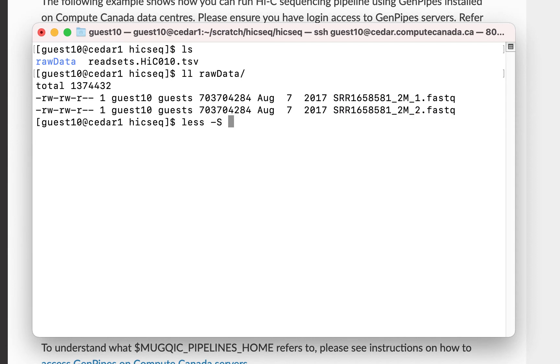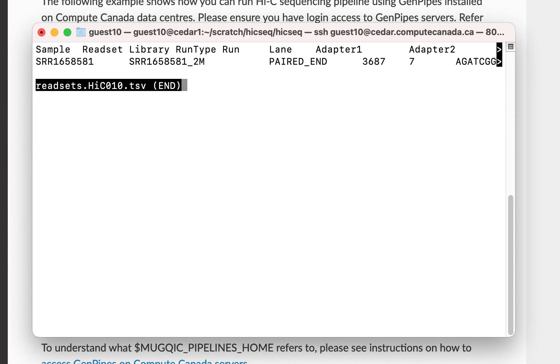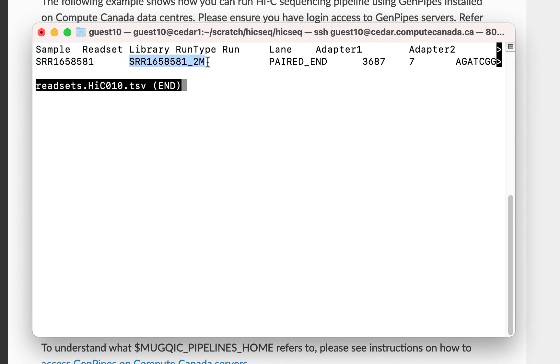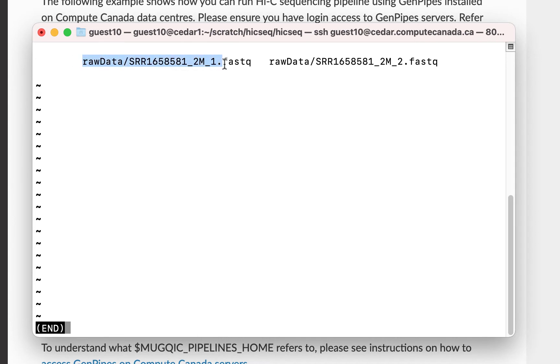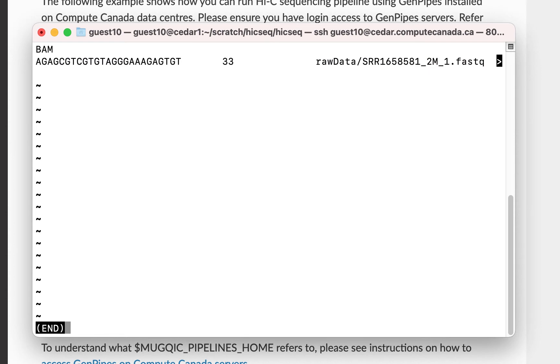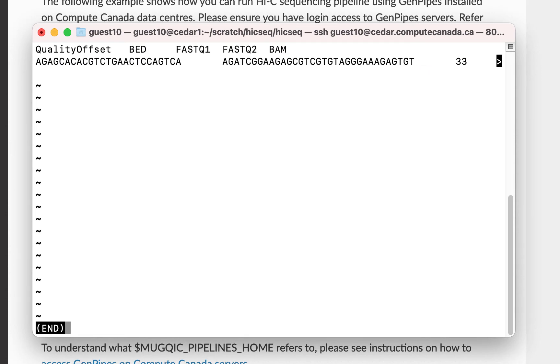You can also see the raw FASTQ files inside the raw data directory. Let's open the readset file. It consists of several required columns. You can see the sample and the readset name. Also, you can see the paths for FASTQ files.